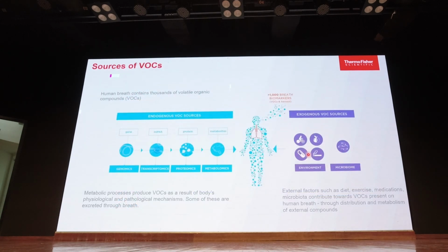The source of VOCs can be endogenous, within the body, where different organs give them out, but it can also be exogenous. That means from the environment, from the food that we eat, medicines that we use, or the exercise that we do. So it is a complete phenotype of the individual. It gives you information about that particular individual, not only endogenous, but also exogenous.